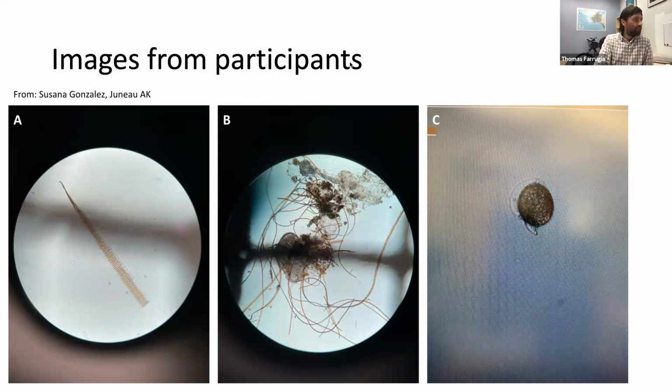This was sent in by Susana Gonzalez, who's working down in Juneau right now, with a few quick pictures here. Is there anything that jumps out at any of you as to what these may be in these different slides? This one, C, here, being a non-expert, looks like a Dinophysis, but am I being fooled?